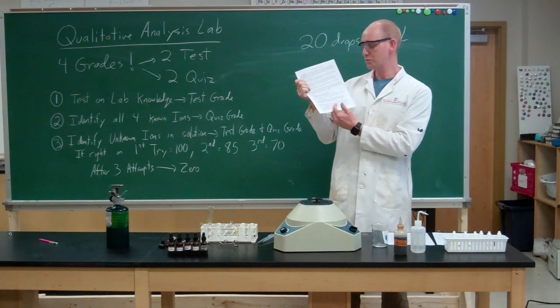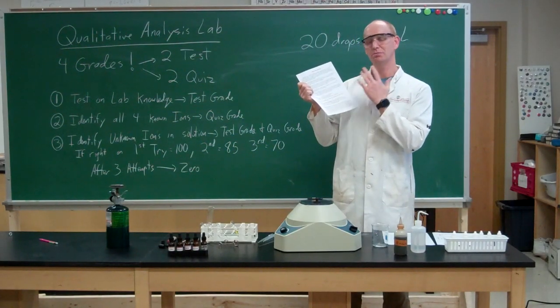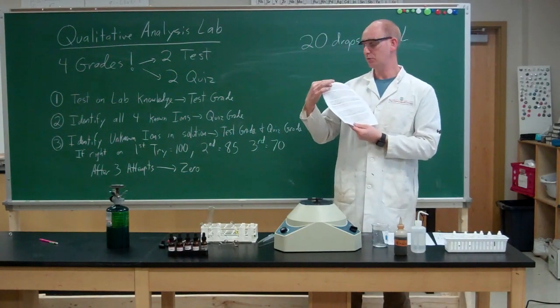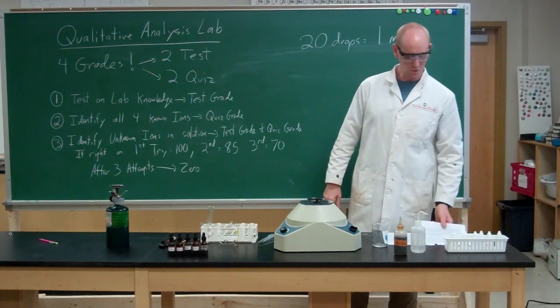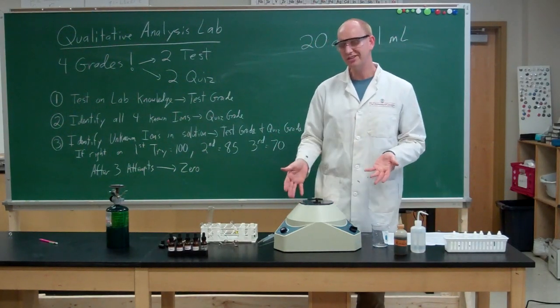So I've gone through the centrifuge procedure. I haven't gone through the precipitation completion, just add a little more to it. And what I'm doing now is on the back, I'm doing the removal of the filtrate and the washing of the precipitate. I'm going to let this go a full 2 minutes.